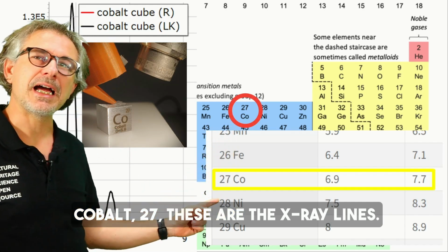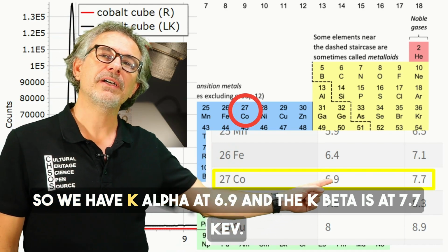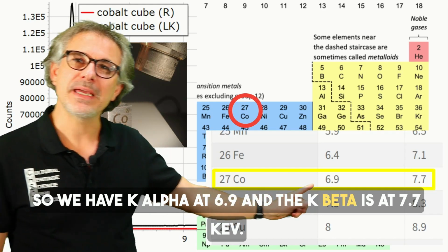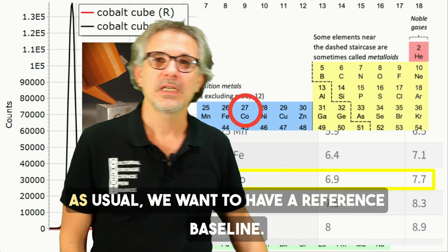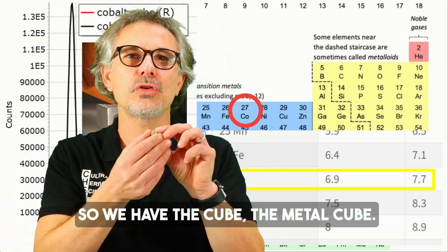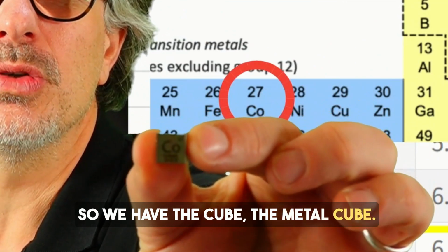Cobalt-27, these are the X-ray lines. So we have K alpha at 6.9 and the K beta at 7.7 keV. As usual, we want to have a reference baseline, so we have the metal cube.